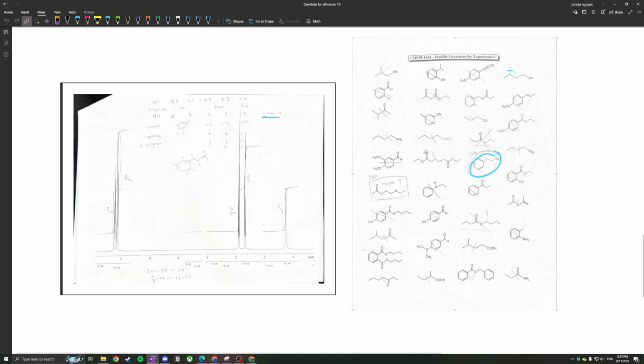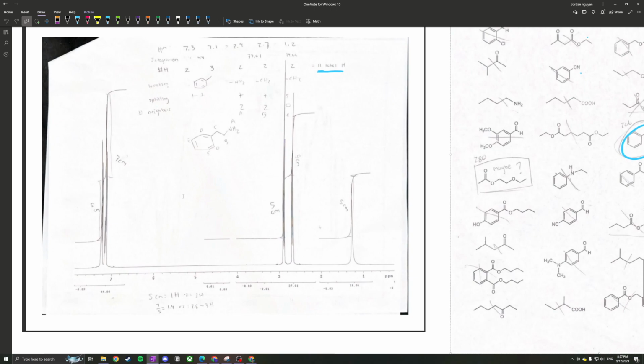Since this one is primary, I was leaning towards the one that I'm pointing at with the arrow, because it has 11 hydrogens. For the location, splitting, and number of neighbors, I know the one furthest to the right is a singlet, because it's the most easily visible.